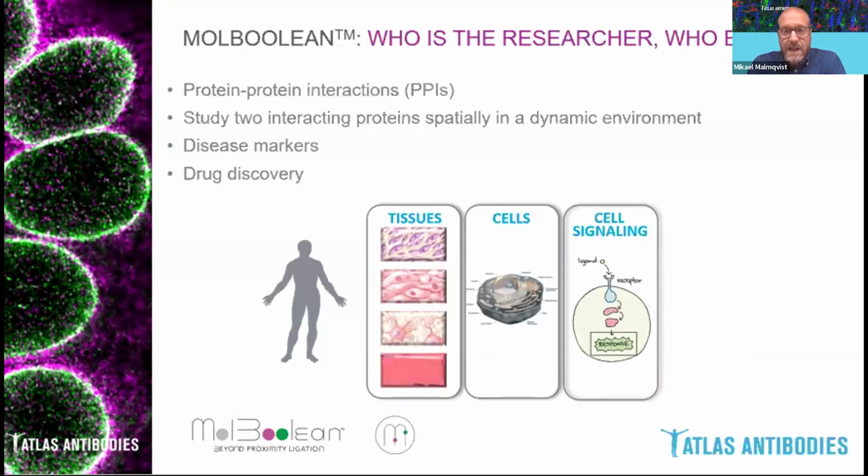As Ola has clearly described, MolBoolean differs from other methods in that you can study free and interacting fractions of two endogenous protein targets simultaneously. So by applying the MolBoolean technique, we can monitor the cellular distribution and protein complex formation of important disease markers in cells and tissue, and therefore improve our understanding of diseases. This can provide the basis for translational research to discover new therapeutic approaches within drug discovery, where MolBoolean can be used to elucidate the mechanisms of drug action on a protein-protein interaction.